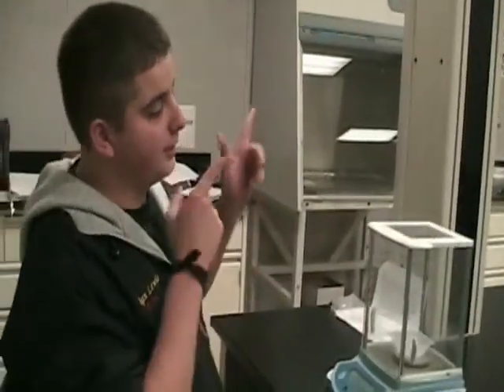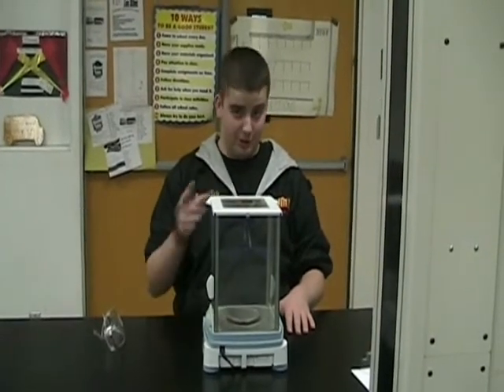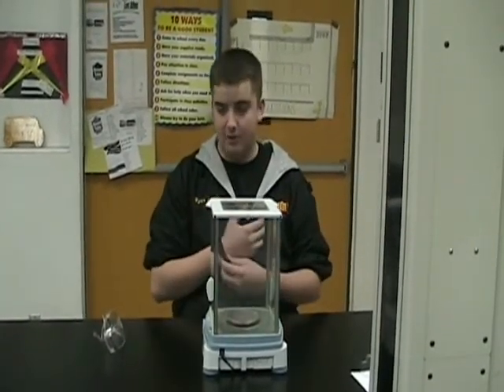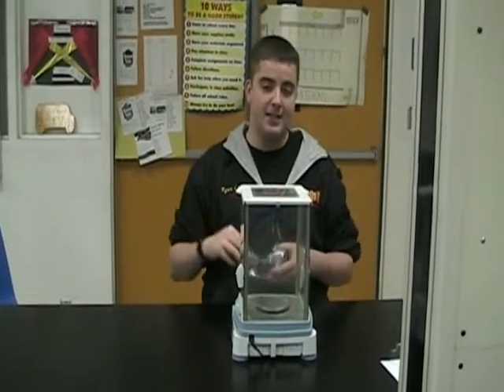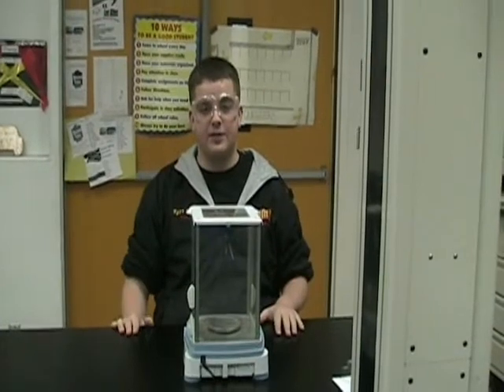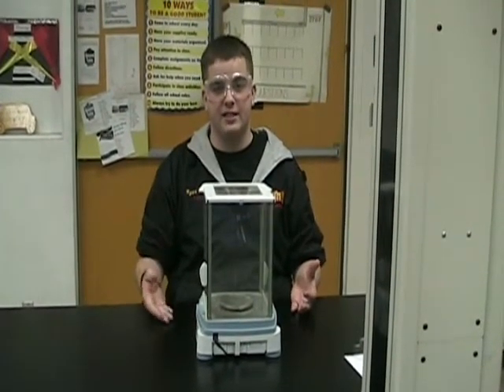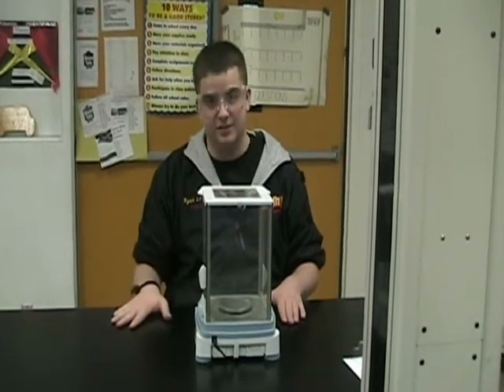And that's how you prepare your analytical scale before you start measuring substances. Before you start measuring, it's always necessary that you wear protection. Safety goggles are always necessary. Safety gloves are sometimes necessary depending on what substance you are dealing with.